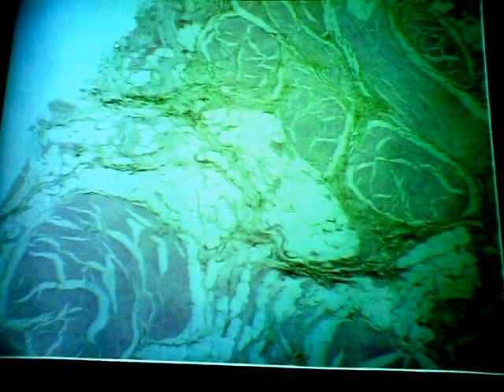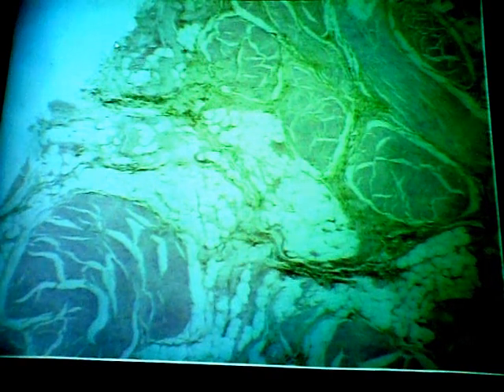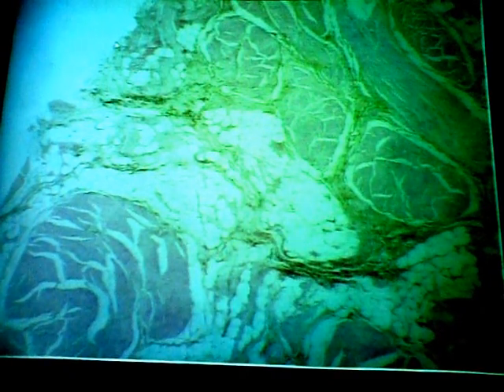But again, if I put a point on one, don't give me the whole wall. You don't need to impress me with your knowledge. Just say, okay, it is smooth muscle, how's it arranged? Longitudinal or circular. If you put the whole wall, I'll ask which one, all right? So please answer the question. Don't go through the whole wall. Okay, that's it. Any questions?